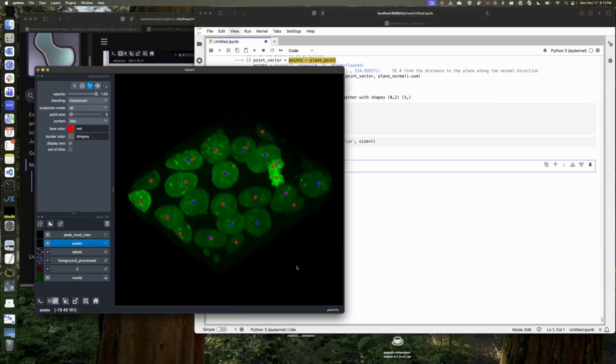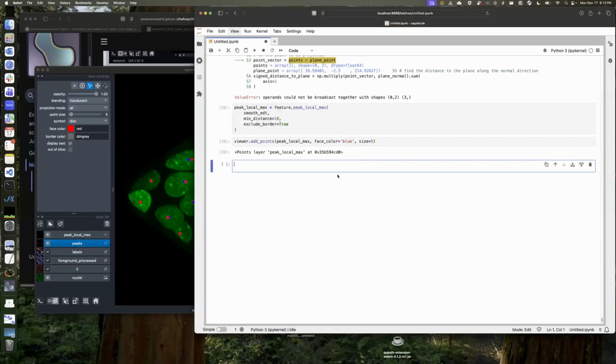I'm actually going to put both of them up like this. That's kind of cool looking. And then I'm going to say NB screenshot.